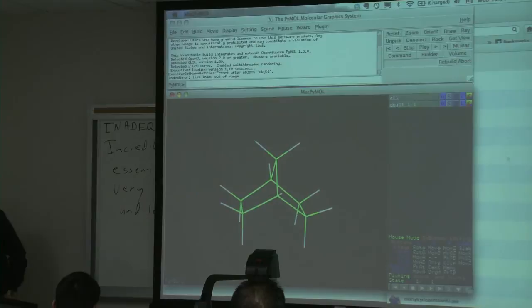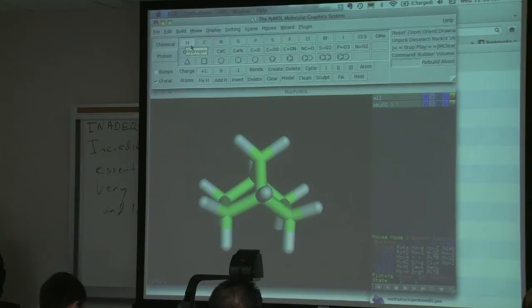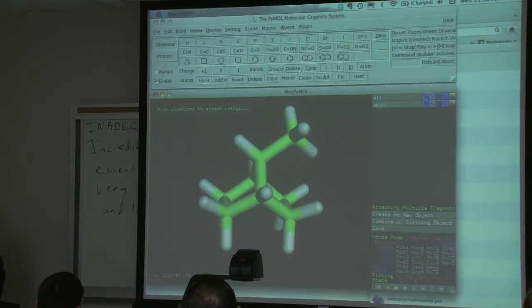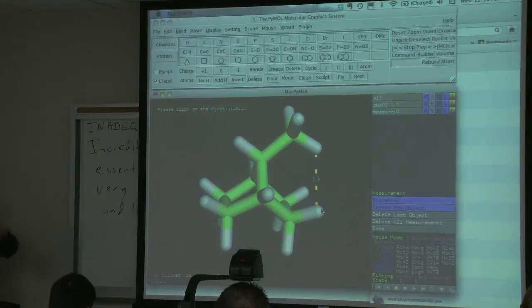But now you can start to imagine issues like when we were dealing with the camphor problem, and the question of what's the distance of a methyl in the bromocamphorsulfonic acid problem. What's the distance here? I'll even clean this thing up, not that we really need to measure a basic distance. What's the distance for, say, a cis distance? Because that was where we had this issue of, is the bromine pointing up or is the bromine pointing down? And you'd be able to look and say, okay, by golly, a cis distance is going to be a nice strong NOE.